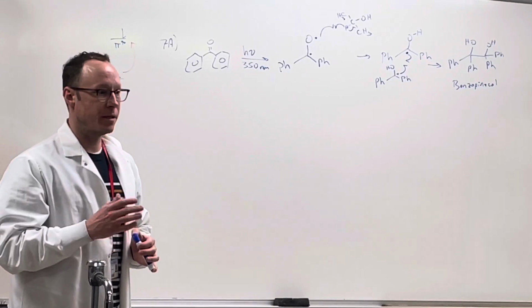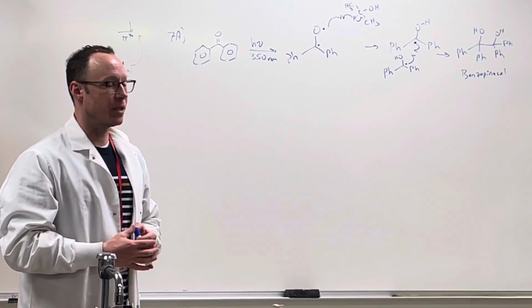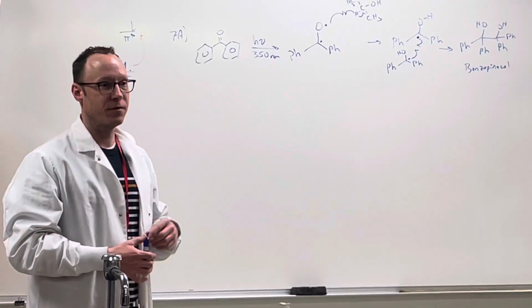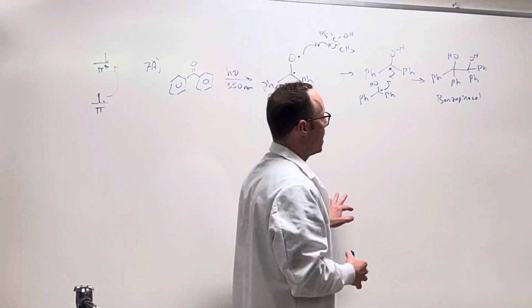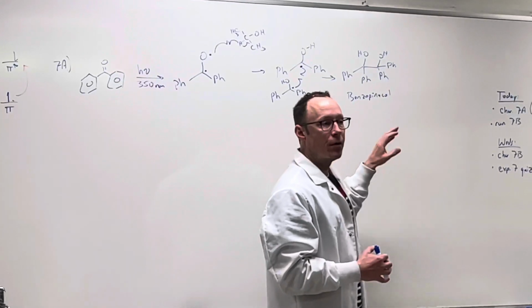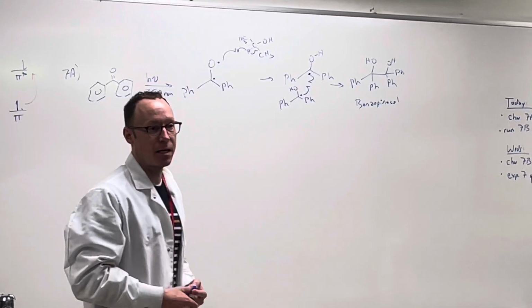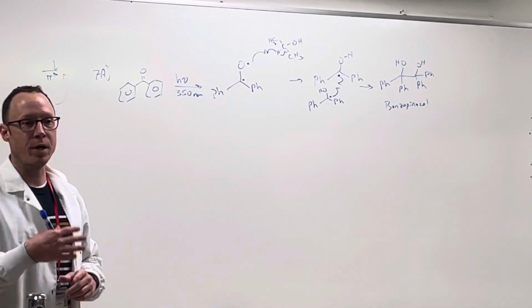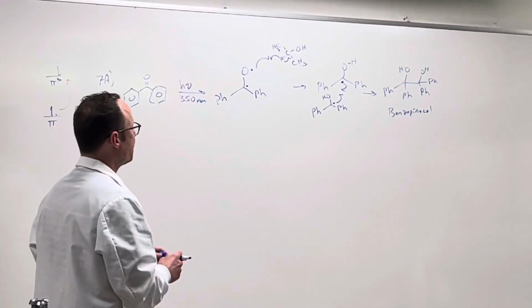Remember, they're coming directly out of isopropanol, so you don't want to characterize that wet because you're going to end up seeing a bunch of OH stuff contaminating. So once you do the filtration, put it in the oven for a little bit, and if you want to, you can go ahead and get your experiment for 7B set up then. Set up your reflux apparatus and do all that while you're waiting on your crystals to dry. Okay.